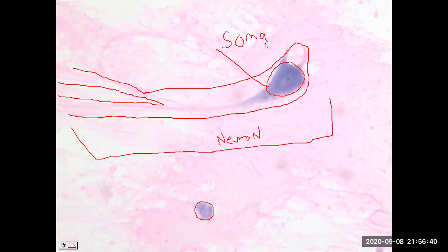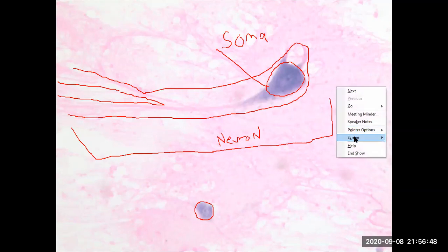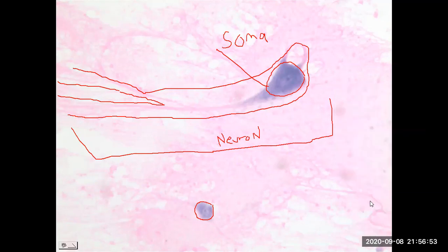And now we have the rest of the cell beyond the soma. You notice there's branches on this side and branches on this side. And we'll just change colors. For now, we're not going to be very specific. Either side, the branches here or here in pink. For now, we'll just use the term nerve fiber. And you can see there's multiple. So as it states in the lab manual, we won't distinguish the two sides yet.